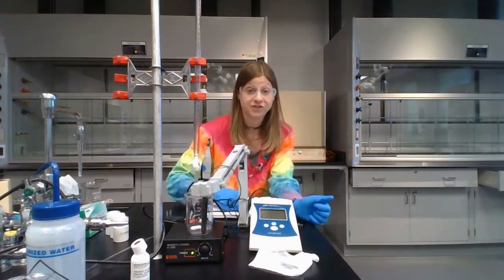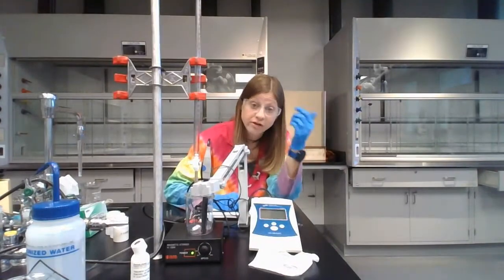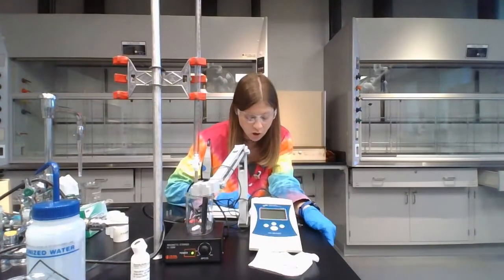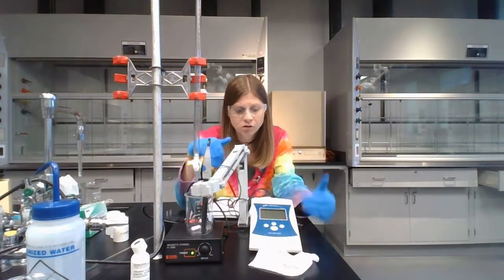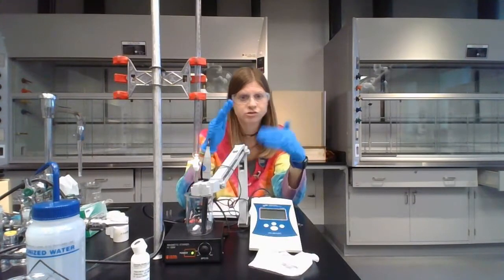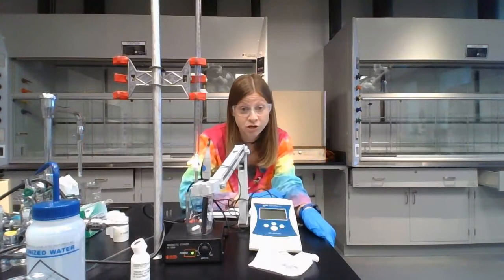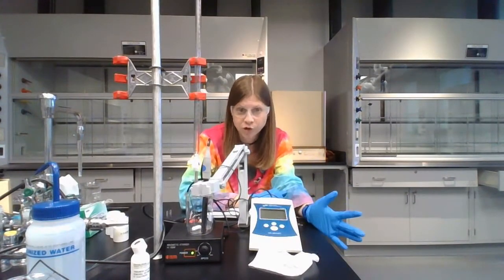So you'll record the pH for that. And then next, you're going to add another 1.00 milliliters to move the burette from 1.00 down to 2.00. In your data table, you'll write down 2.00, and then you'll record the pH value. Now, I will warn you, the pH meter is going to take a second from when you add the chemical until it calms down. Just like with balances, the values are going to fluctuate a little bit, and then they're going to get to a steady spot, and that's the value that you record. So you're going to have to give it a second before you write down your number.